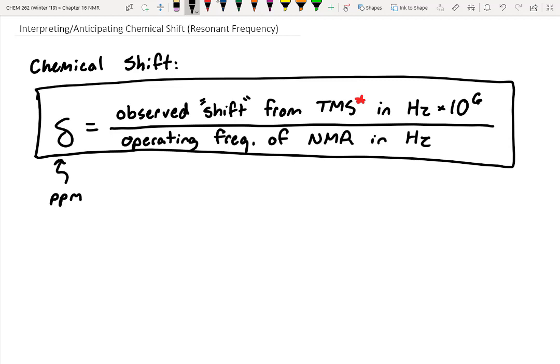Was that what you were going to ask? No, I was actually going to ask if they're all like absolute zero or close to absolute zero inside. Inside the magnet? Close. So the big superconducting magnets are cooled with liquid helium. So they're, I think, 5 degrees Kelvin. Yes, it's very, very cold, but they're very expensive to run.